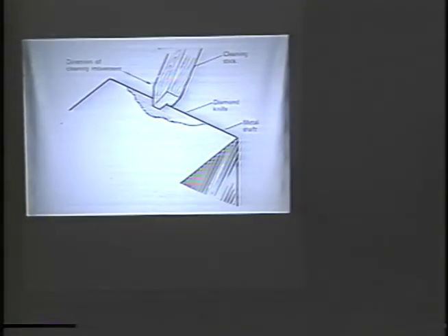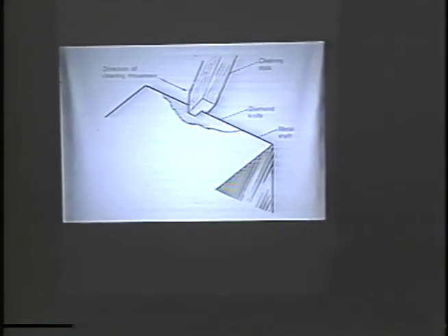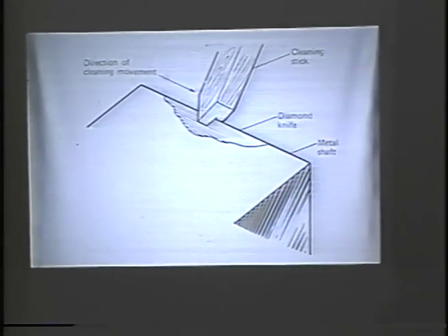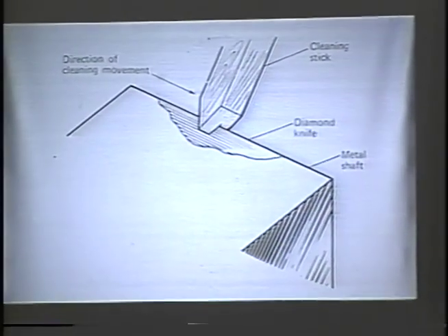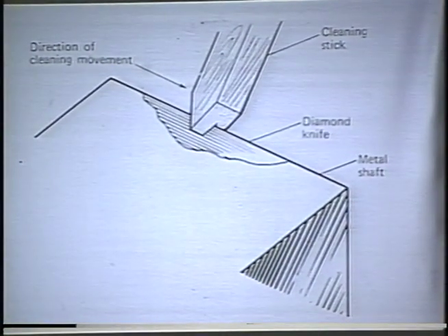And after that, they proceeded to cut several thin sections, demonstrating that the diamond was not bothered at all. Then, after that, they took a piece of Ross lens tissue and dragged it across the knife edge. And the knife was ruined.